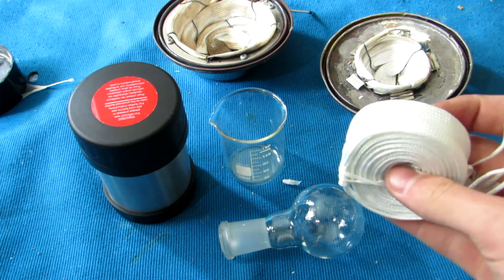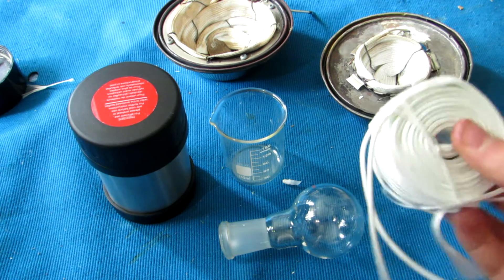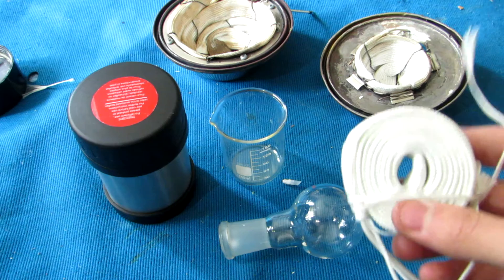These high temperature heating tapes can be purchased on AliExpress for a few dollars, and reach temperatures up to 700 degrees Celsius when properly thermally insulated.